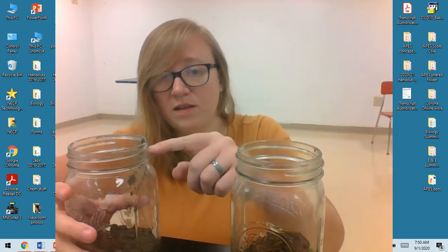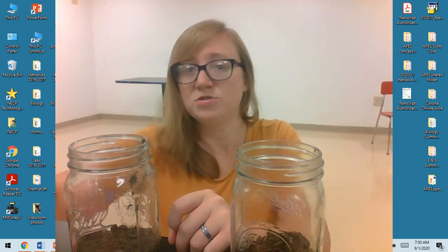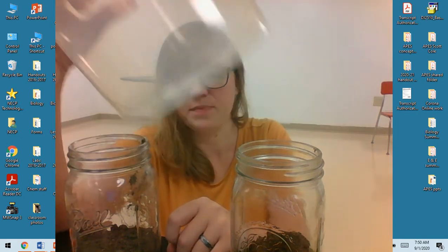Then I'm going to fill the rest of this with water. I'm going to transfer it over to here so I can mix it all up.